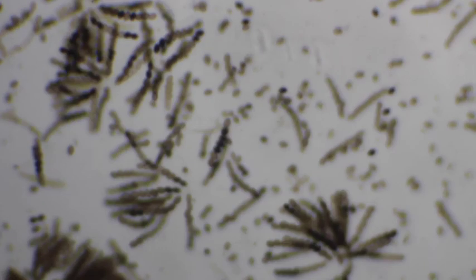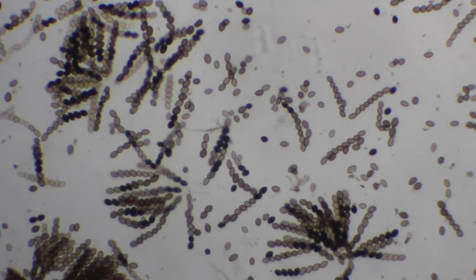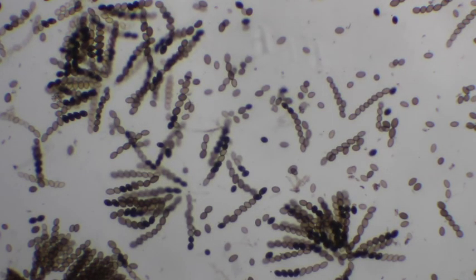There's 2 of them right in the center there that you can use. This one only has 7 spores, but it's looking pretty good. The one next to it is good.